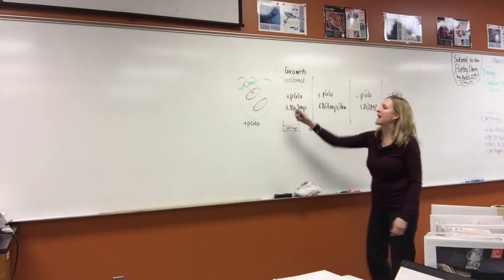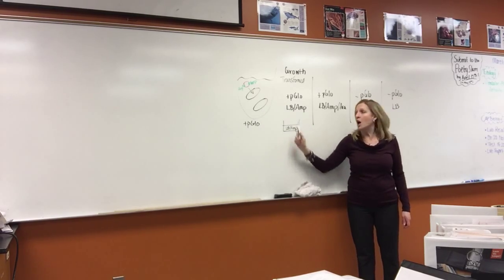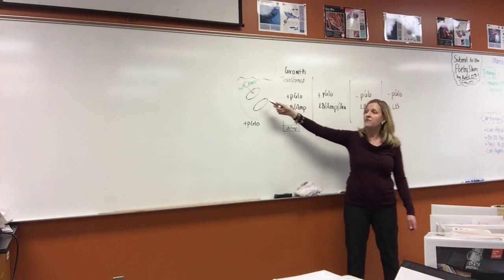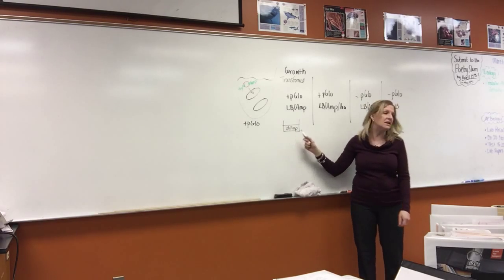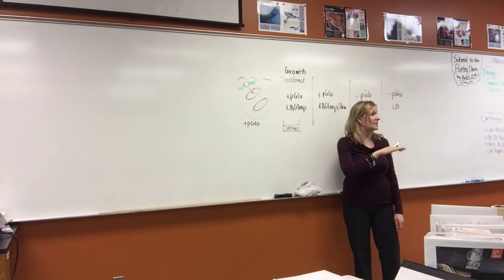So you put both kinds of bacteria on this plate, but all the bacteria that weren't transformed died due to the ampicillin. Only the ones that have the plasmid were able to divide and make colonies, and so the colonies that you see on there are colonies that have that plasmid. What you can't see is a bunch of dead bacteria on the top, okay?